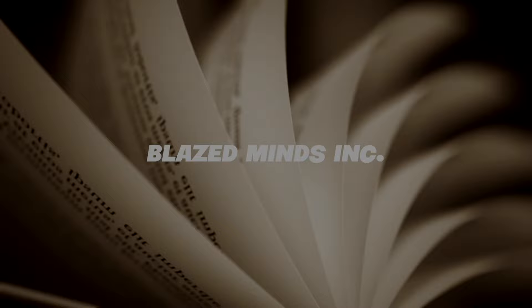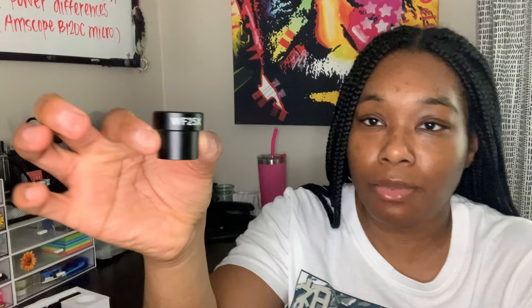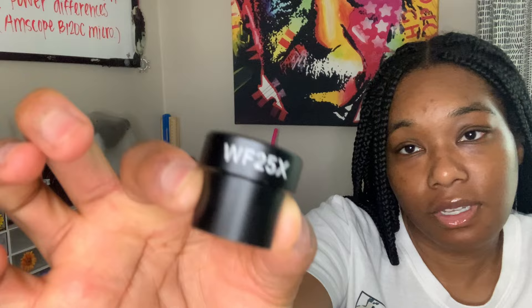Okay guys, welcome back. Let's go over the ocular lenses and what they are. I have them right here — this is how I have it set up now. It comes with two; I'll show you one of each. This is the wide field 25x. It's a lot smaller than the 10x. And then this is the 10x right here.